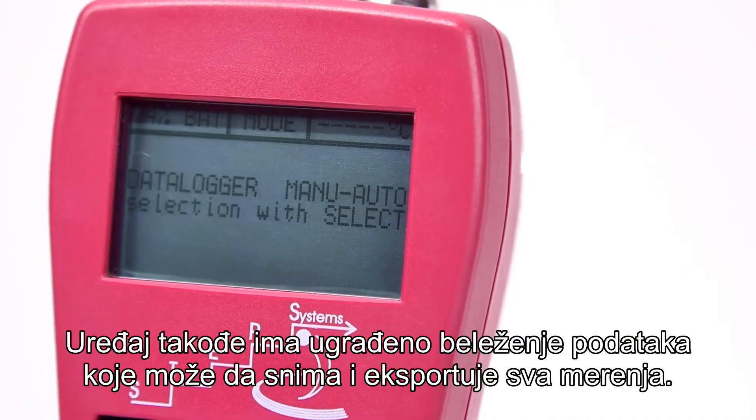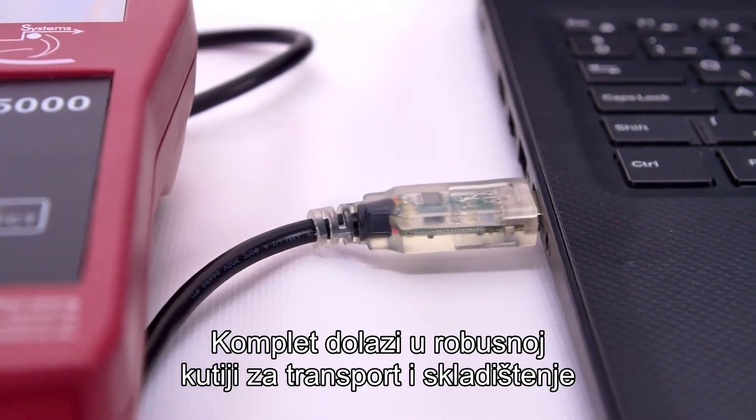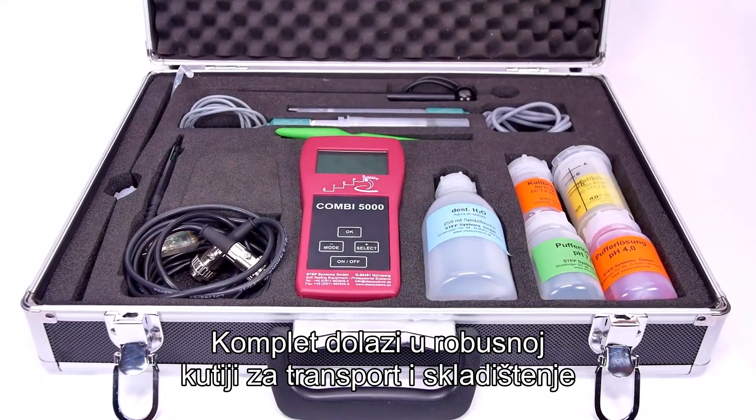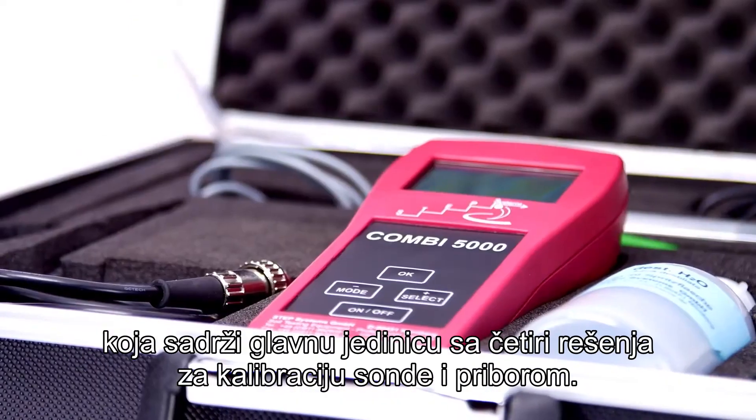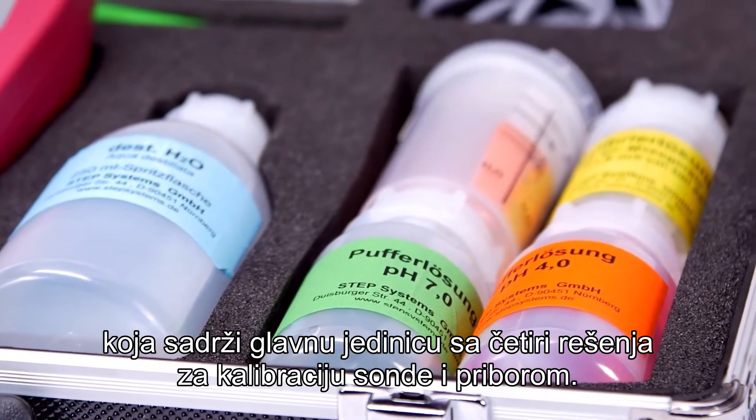The device also has a built-in data logger, which can record and export all measurements. The complete kit comes in a rugged transport and storage case, which contains the main unit with four probes, calibration solutions, and accessories.